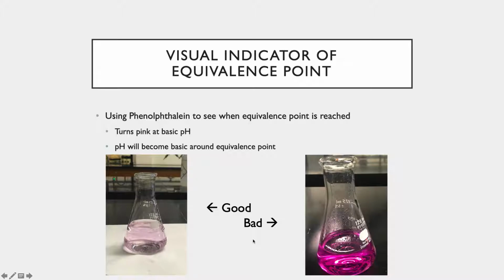So as you're doing the experiment, you are going to be doing 3 trials of this titration. I would at least aim to have one of your trials hopefully look like this towards the end. And to get something that looks like this, you are going to have to be careful as you do the titration, particularly as you get around to where you know that equivalence point is. You're going to have to be very slowly adding, because it might only be 2 drops to go from this to this color-wise, which is not a lot, and so you have to be very careful and cautious if you want to get the most accurate results that you can out of this lab.